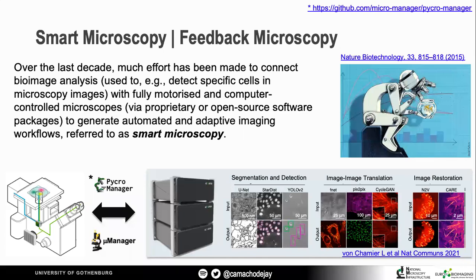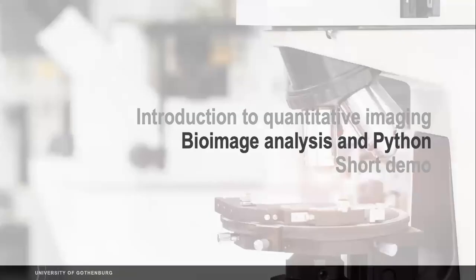I'm not going to talk too much about it today, but one of the things that we use a lot here is actually Python. Because there is a very cool project called Micromanager that allows you to control your microscopes and is very open. So if you have all your image analysis already in Python, then you can use Micromanager to put things together, right? So if you're interested in this type of thing, please let me know later on.